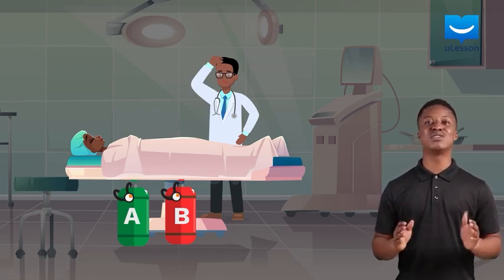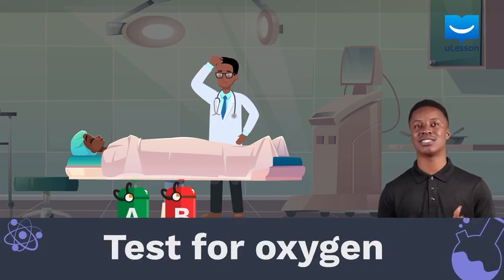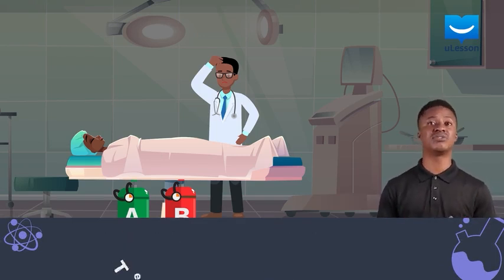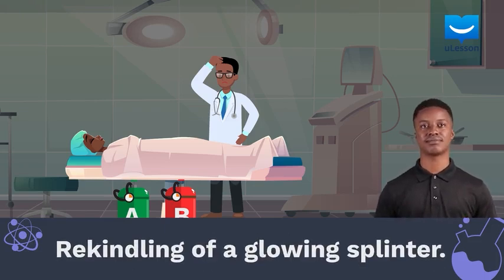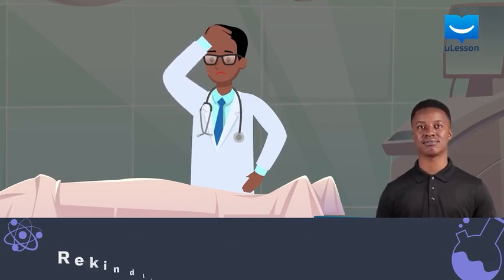Well, this brings us to our lesson on the test for oxygen. In this lesson, we will learn how to certify that an unknown gas is or isn't oxygen. The test which often distinguishes oxygen from other gases is the rekindling of a glowing splinter. Now, let's assist this confused doctor by carrying out an experiment to determine which canister contains oxygen gas.